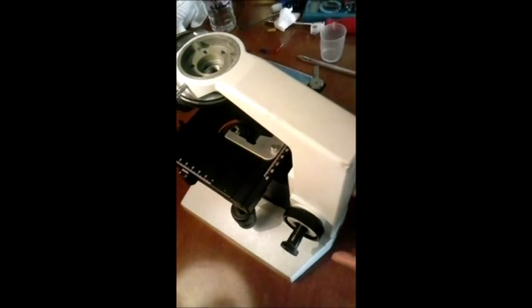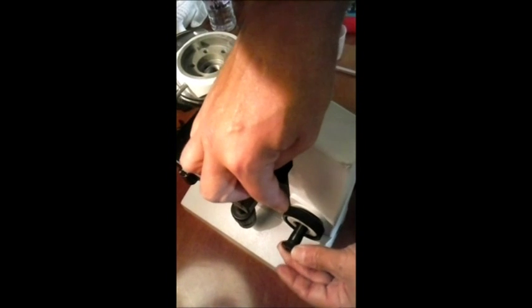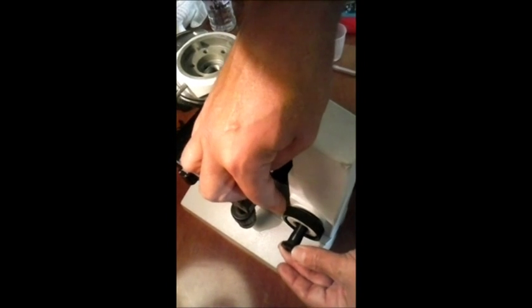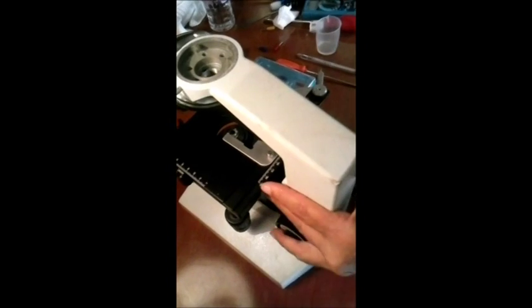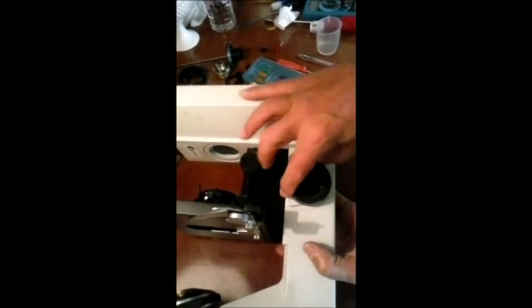Dentro ele tem uma engrenagem que está travando na engrenagem interna do mecanismo da chariote. Então, vou dar uma pausa aqui pra mostrar pra vocês o porquê que o micrométrico, o tubo do micrométrico não sai.